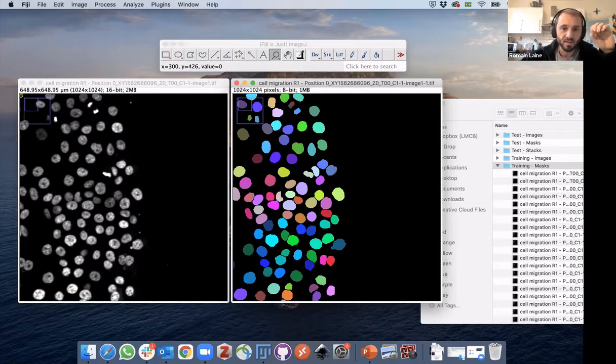This particular kind of data is so-called instance segmentation. What this means is that each individual object is segmented separately as a separate object. As I said, it's really useful because you can isolate very easily each individual object afterwards. Okay. There's another case of so-called pixel segmentation, which is what you've seen for UNet, for instance, which will, to a large extent, only segment between background and foreground. So, for instance, in EM images, segmenting membrane.